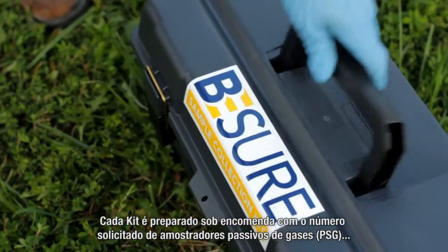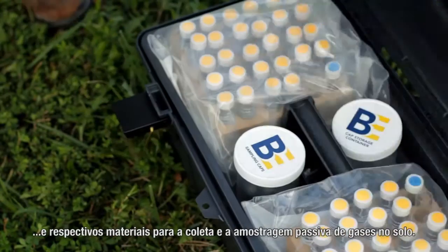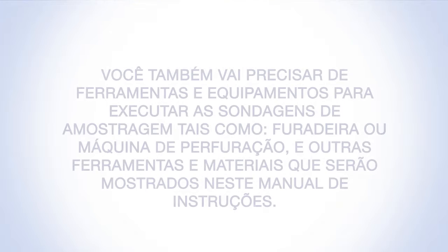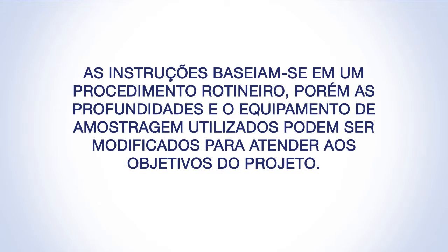Each kit is custom prepared to include the requested number of PSG samplers and associated materials to collect passive soil gas samples. You'll also need tools and associated supplies to create the sampling holes, such as a hammer drill, slide hammer, or soil auger, and other common hand tools. The instructions provided are those routinely followed; however, actual sampling depths and sampling equipment used may be modified to meet project objectives.